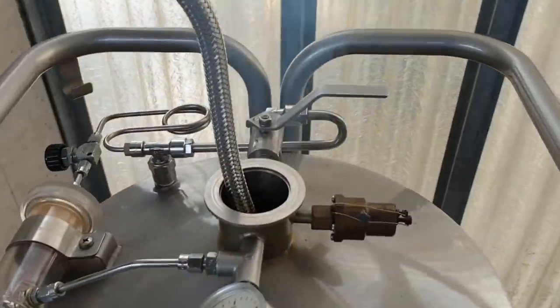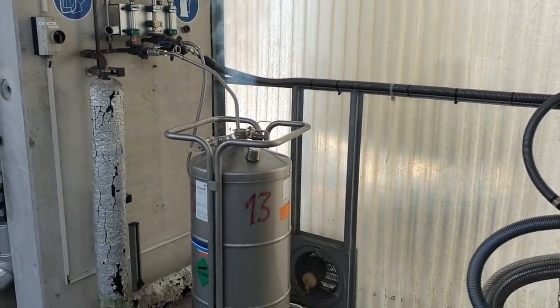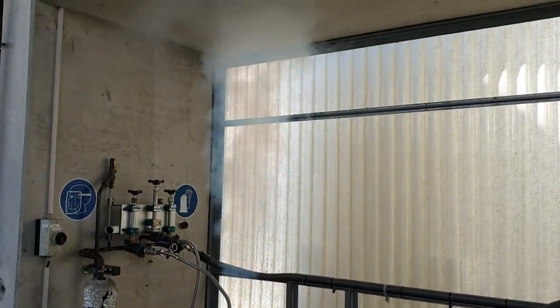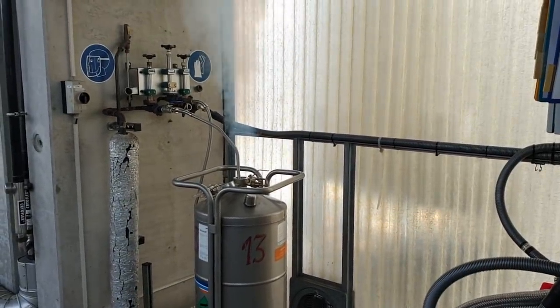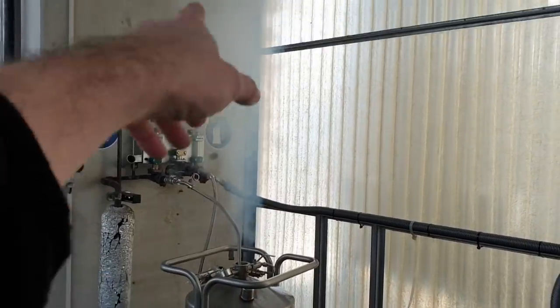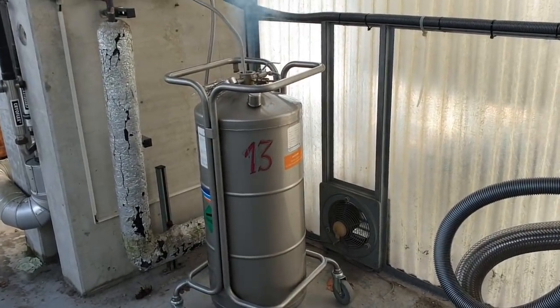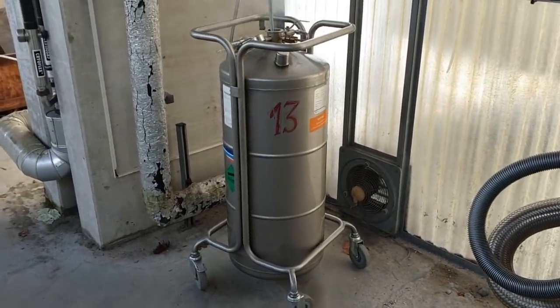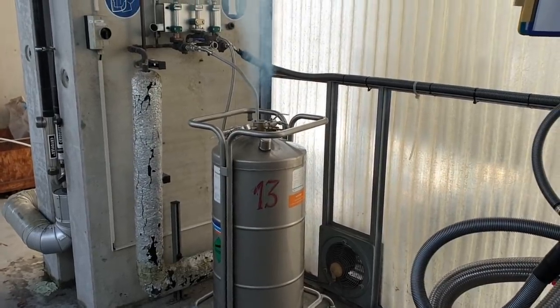Initially it's just going to have to cool down all of this. Now the one thing you have to be careful with nitrogen is: if you breathe nitrogen, you've got no real detectors in your blood that tell you you're low on oxygen. So with a decent nitrogen blanket, if you start breathing it, you just black out. The classic way to kill yourself with one of these is you do it in a fairly small room and you sit down whilst it's spilling. The nitrogen just comes up, you feel a bit dizzy, then you black out and that's it — you asphyxiate because there's just not enough oxygen in the air.